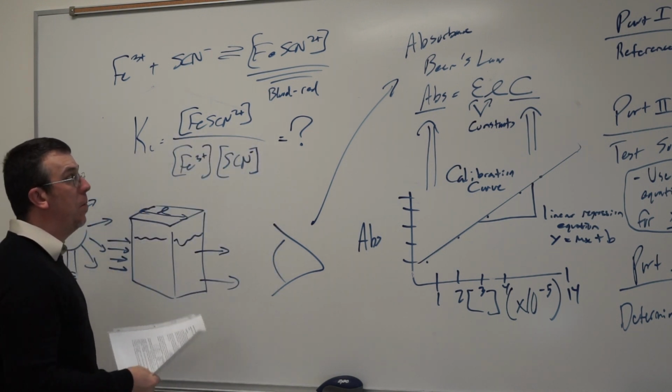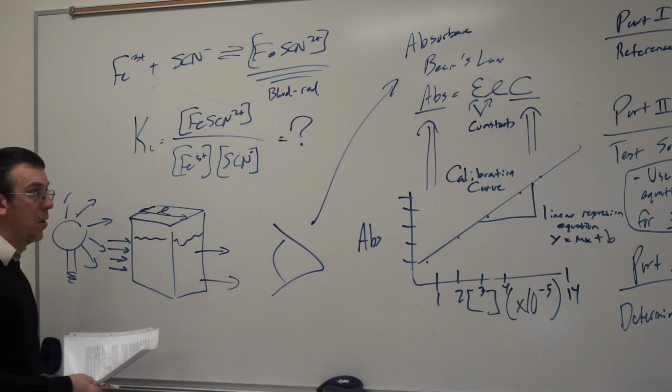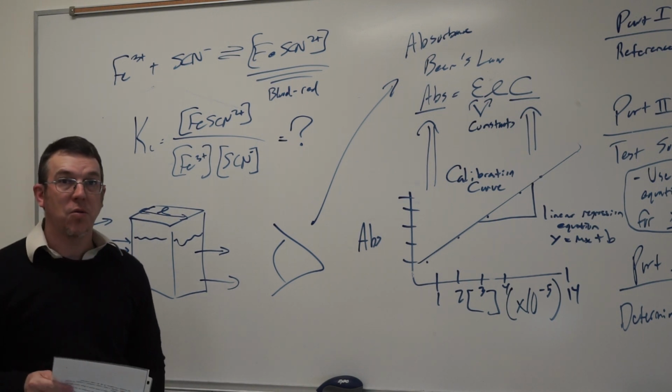And so we're going to use that to our advantage, because our goal is to solve for the equilibrium constant, but to help us to determine this, what we're going to do is use a technique that's called spectroscopy.